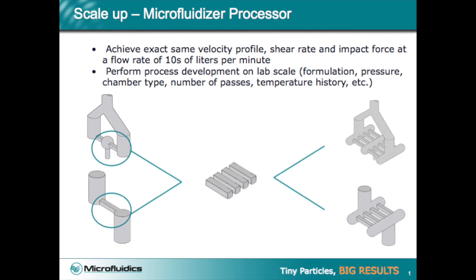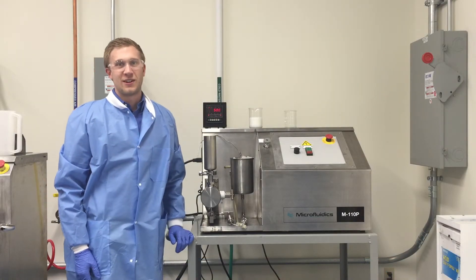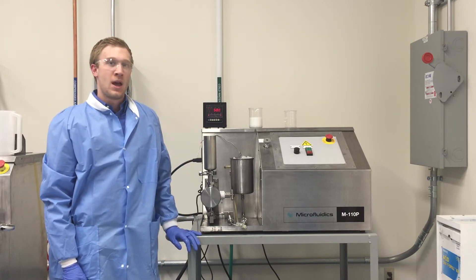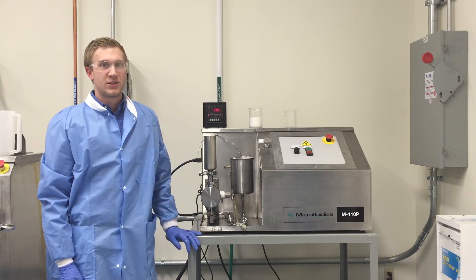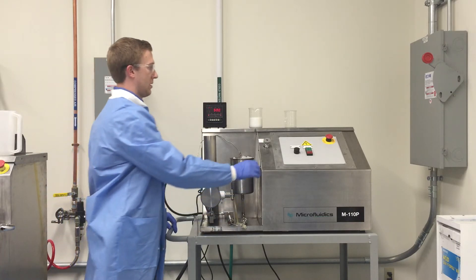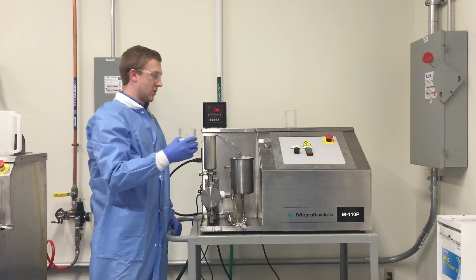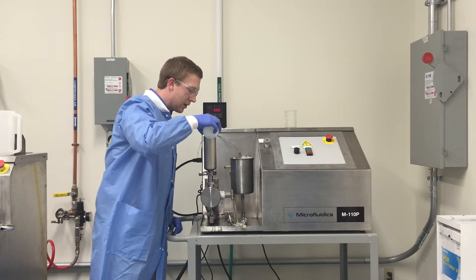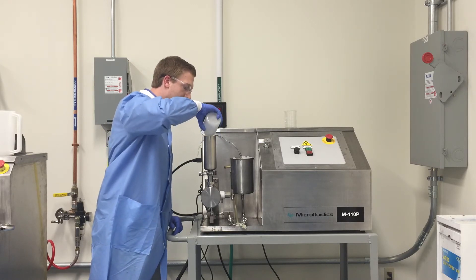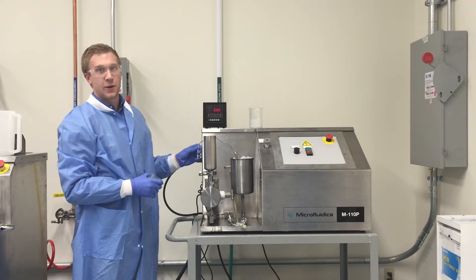Next you will see a demonstration of the squalene nanoemulsion being processed on the M110P microfluidizer processor. Welcome to the Microfluidics Technology Center. Today we're going to process a squalene nanoemulsion through a Y-type chamber. We turn on the microfluidizer, pulling the pre-mix into our inlet. We're going to process four passes at 30,000 psi.